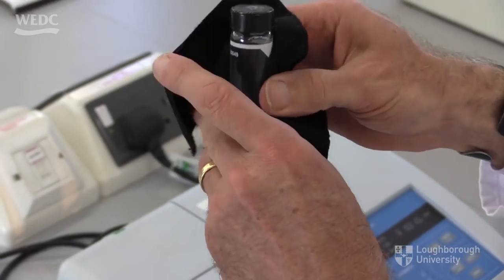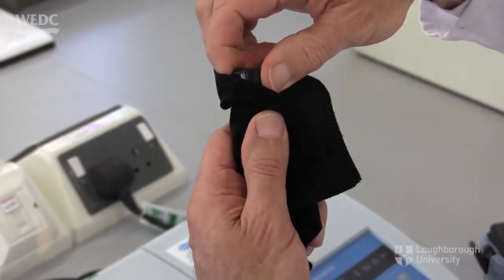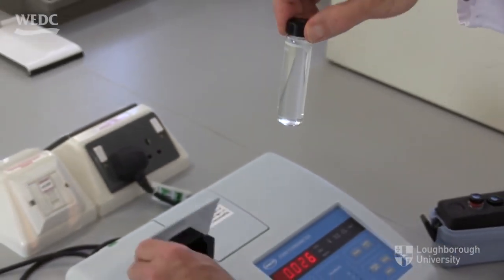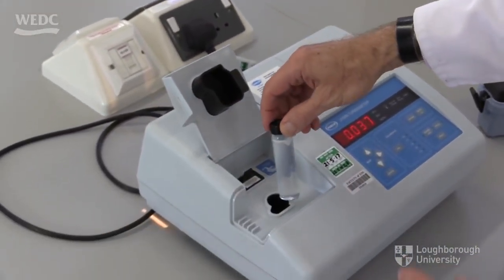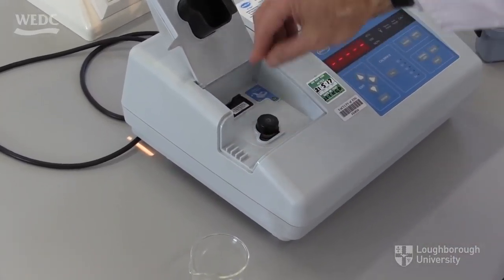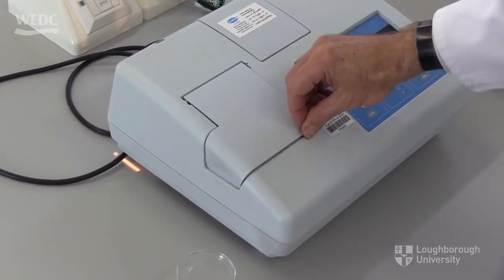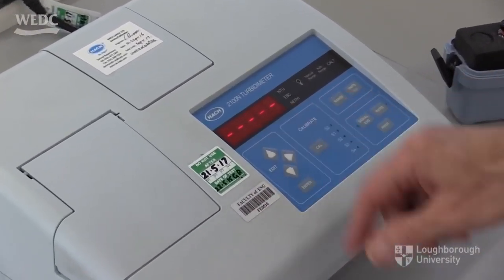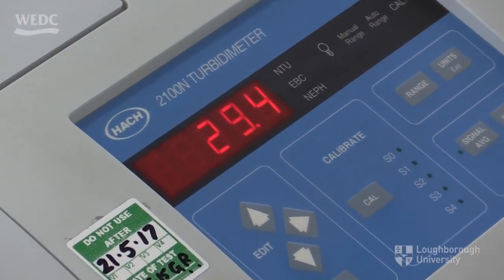Next, clean the exterior of the tube, as you want to measure the turbidity of the water and not the cleanliness of the glass tube. Opening the lid of the turbidity meter, place the sample tube into the circular slot provided in the machine, with the white triangle still facing towards you. Close the lid and wait for the turbidity reading to appear on the display.